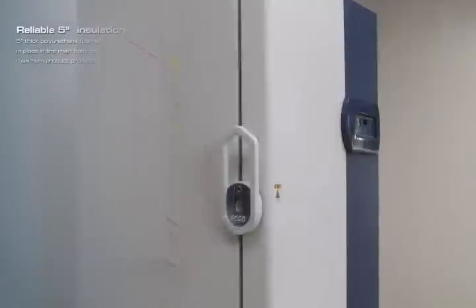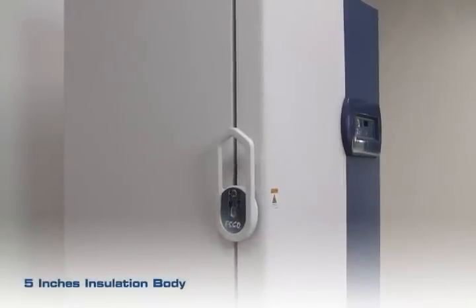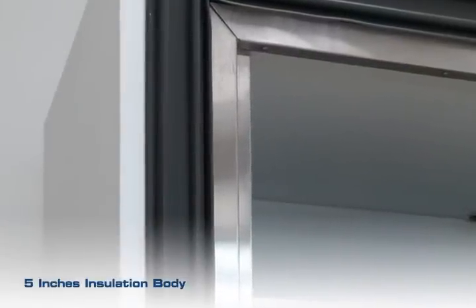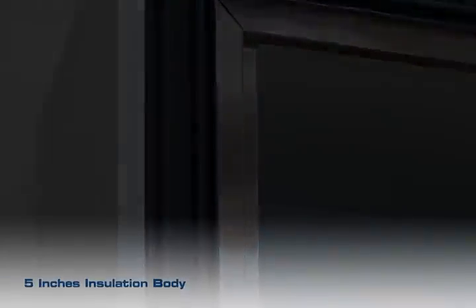A 127mm 5-inch thick polyurethane foam is placed in the main body to insulate the chamber for maximum efficiency by minimizing temperature loss.